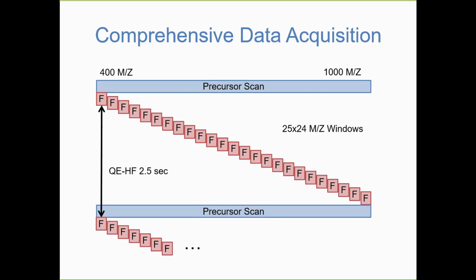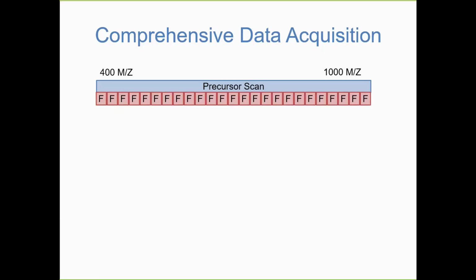ion scans. The idea would be to acquire precursor scans and fragment ion scans that were close enough in time such that you could start to map the shape of a peak, at least with 6 to 8 or 10 points across the peak. So typically you would want to try to get the time down to 2 or 3 seconds between fragment ion scans or repeated fragment ion scans. Now, I'm going to collapse all of those fragment ion scans to show you a bunch of these repeated duty cycles, see what they look like.